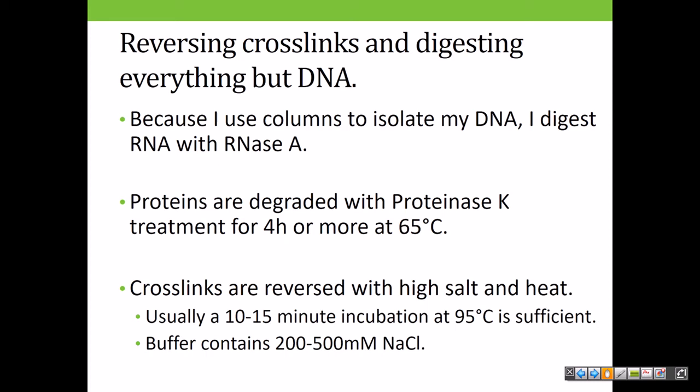Cross-links are then reversed with high salt and heat, especially the heat. Usually this is about 10 to 15 minutes of incubation at 95 degrees. That's not going to hurt your DNA. DNA is going to be fine, and you're going to add 200 to 500 millimolar sodium chloride. Again, your DNA is going to be fine. The RNA is long gone, and of course the proteins have now been degraded.